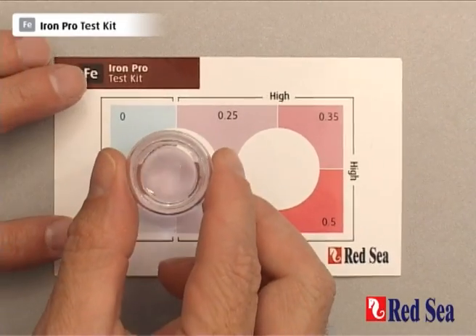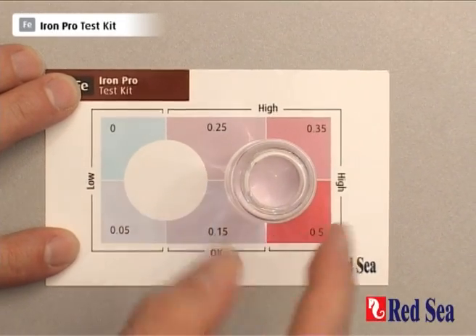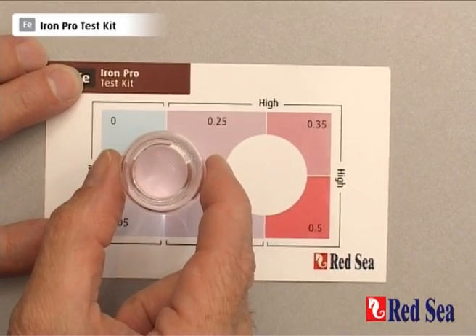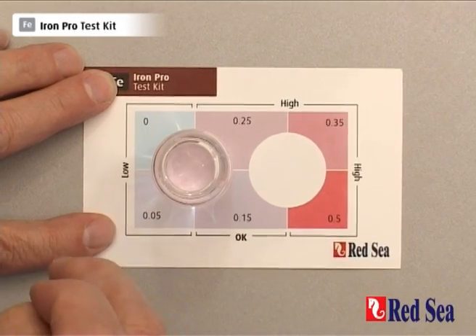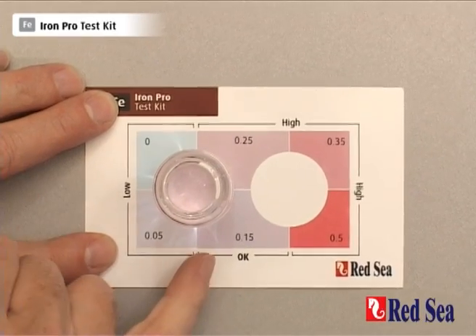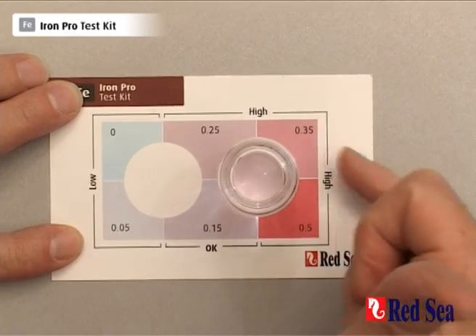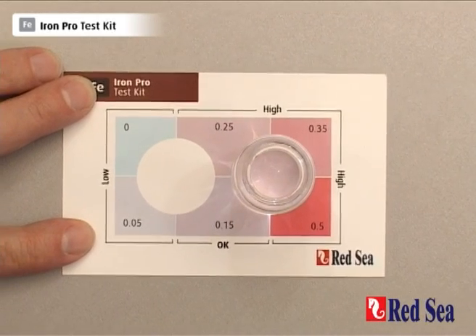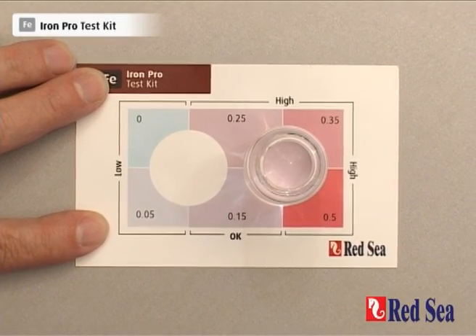We place the vial onto the color card and we move it between the two positions and compare the color in the vial with all of the colors around it. What we can see here is that the color in the vial is very, very close to the 0.25. It's not at all close to the 0.15 and it's not close to the 0.35, so we can state that the iron in our aquarium here is 0.25 ppm. That is the end of the test.